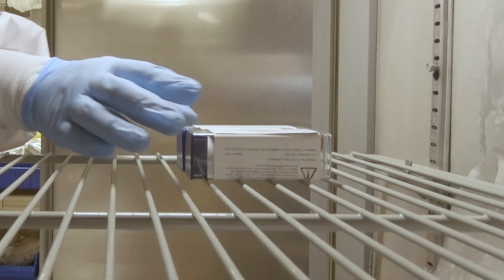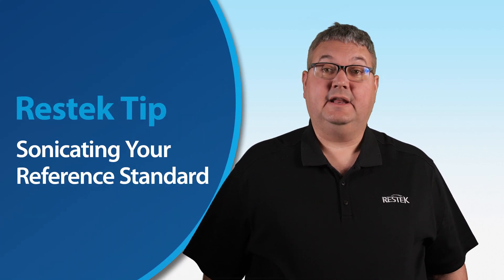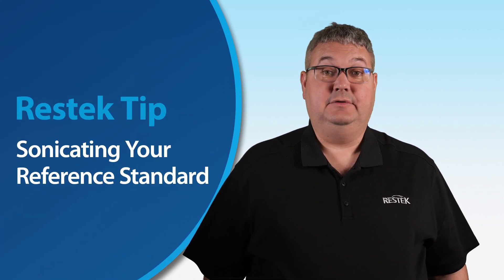Depending on the storage conditions of reference standards, they may need to be sonicated before use. In today's ResTech Tip, we're going to look at why you may need to sonicate your reference standards and how to do it.